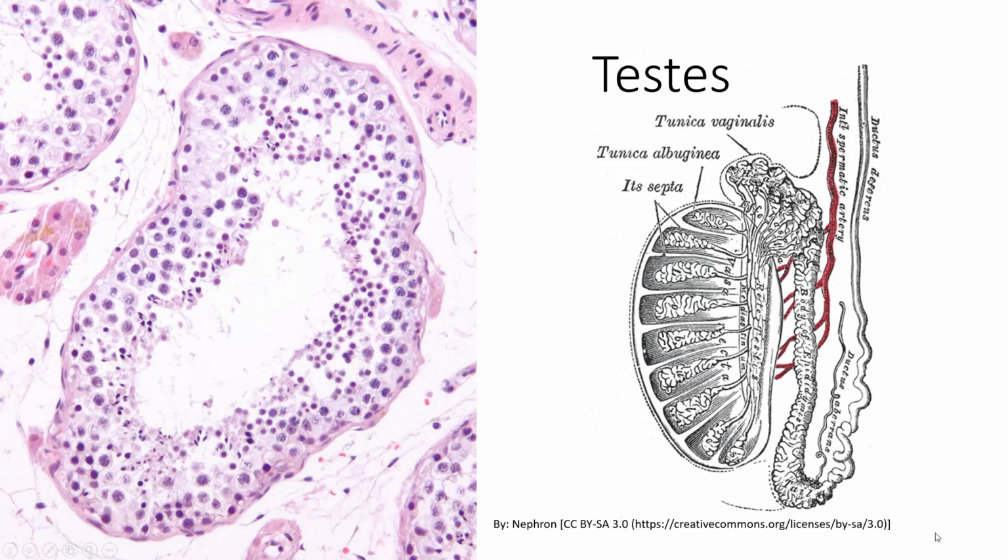Hey y'all, Brown's back. This time we're doing some more histology and we're getting into reproductive histology. So today we are going to be investigating, as you might guess from the cover of this video, the testes.